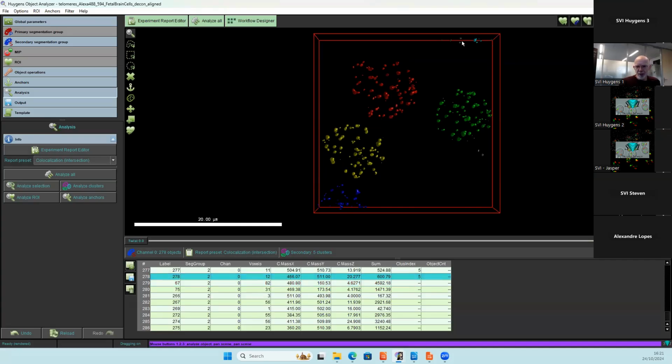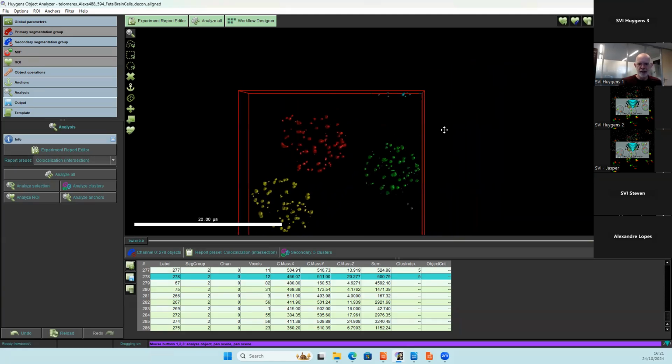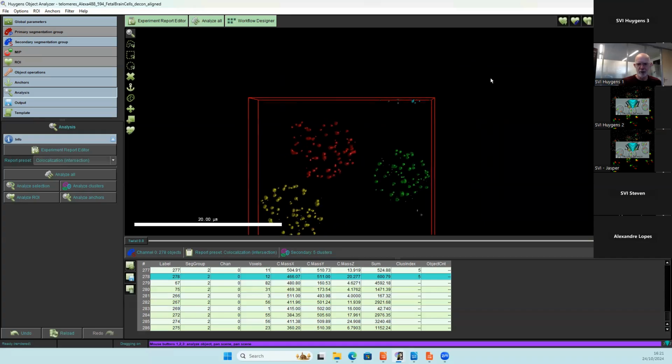There are also objects at the top of the image. And let's just now discard these. This is probably just a small part of a cluster that is below the image that we did not collect. So what I would like us to do, and this is session number D in the manual, is pan the image towards that the top right is in the center of the image. And we can do that with our middle mouse button by holding it and moving it around.